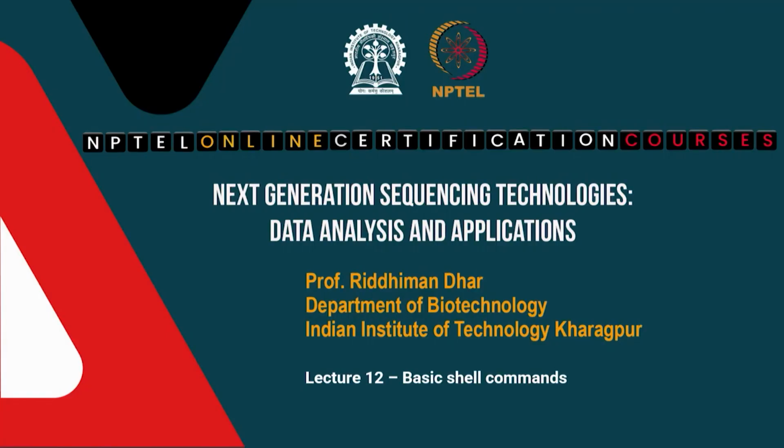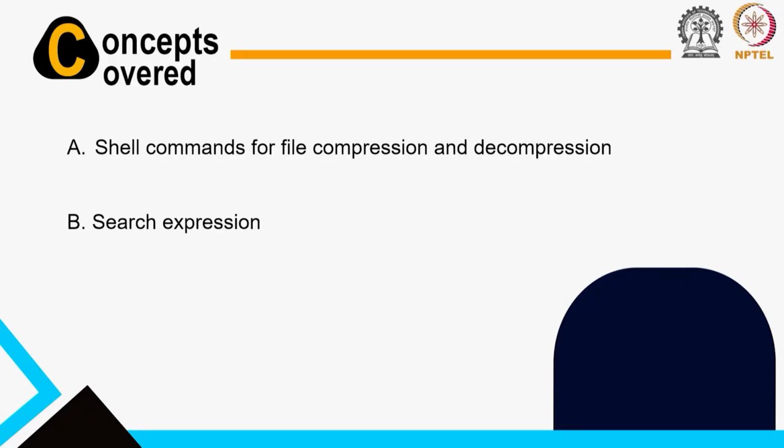Good day everyone, welcome to the course on next generation sequencing technology, data analysis and applications. We have been discussing basic shell commands as part of the first hands on, and we will discuss a few more commands today which will be useful for NGS data analysis. So, these are the topics that we will be covering today.